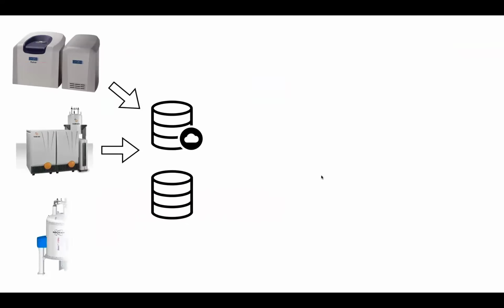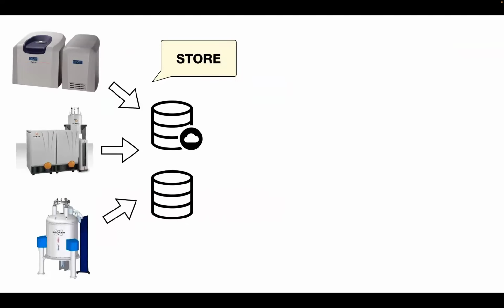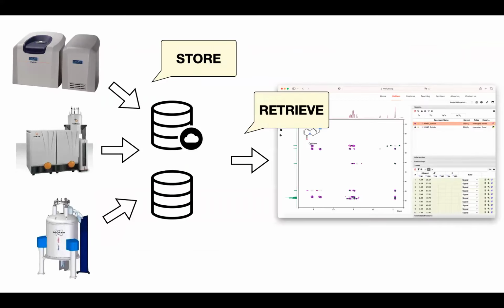So the goal is to store the data in a database as soon as possible, and not only be able from any browser to retrieve the data, but also to analyze the data and save the result back in the database. And often it's an issue because students have everything on their laptop, they leave the lab, and you lose everything. So that was the theoretical part.